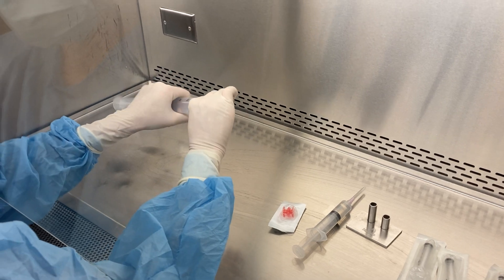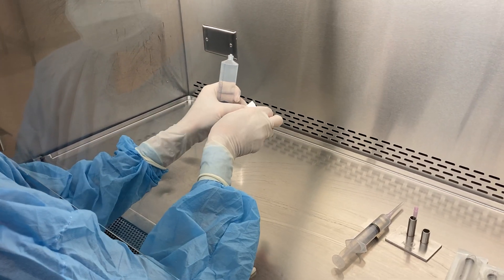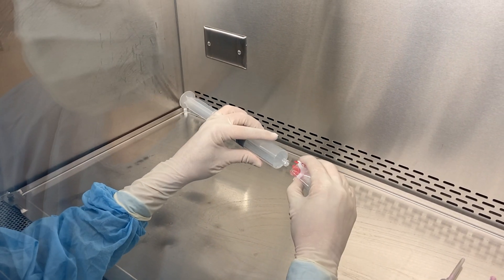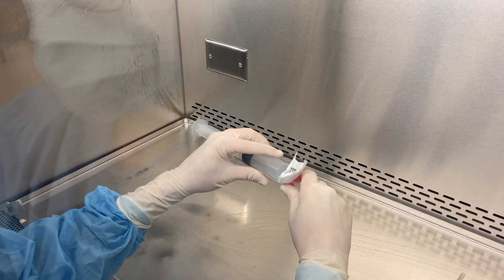I'm going to take the needle off my one syringe — gently and carefully, try not to touch the critical site. Open the packaging and luer-lock my one syringe into the red connector.